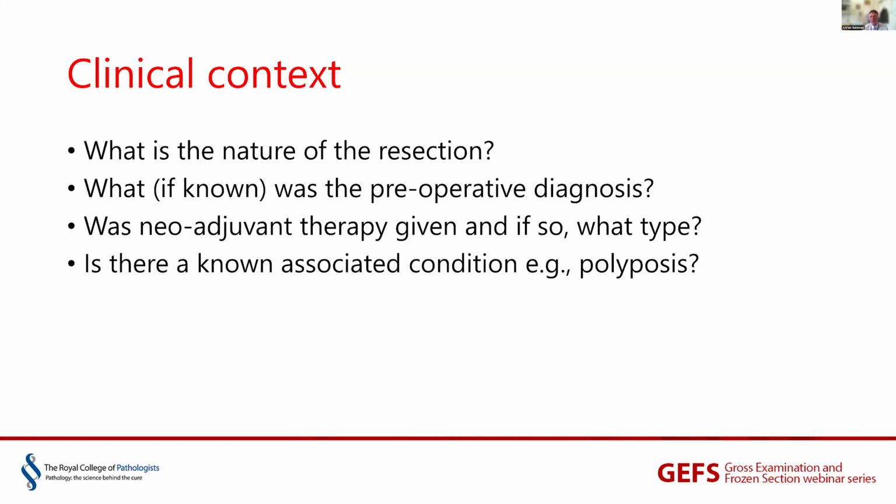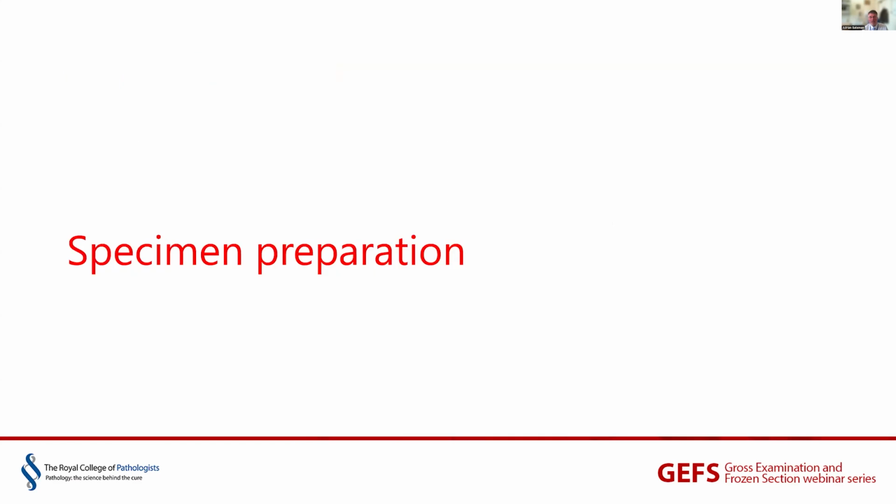We're lucky to have an electronic patient record in Southampton. We can often look these things up. However, it's always preferable that the surgeon gives you as much information as they can about the patient. And then if there's a specific question, you would hope that they want to have it answered. You'd hope that they would actually state that on the form.